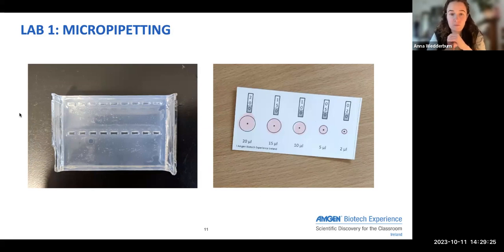My advice for this one would be hands can be quite shaky, I guess. So what I do is I put both my elbows onto the table or the lab bench, and then I help guide the pipette in with my other hand, like that, so then I can pipette in like that. And the other thing to note here is not to put the pipette tip directly onto the black dot, because that'll actually just block the liquid from getting out. So that's the first activity.